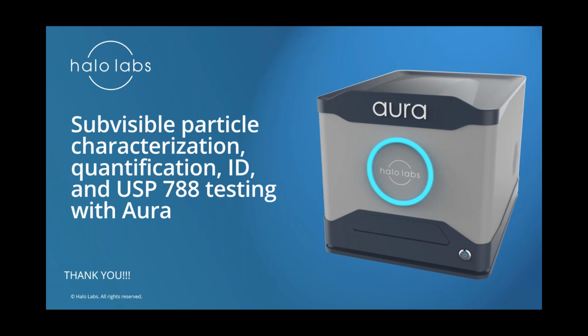I think the jury on silicone oil is out in that it's not immunogenic. While I can understand why some people want to characterize it, plenty of our users have said it's good that we're not measuring things that can confound the measurements, particularly in the small particle size ranges. So in short, we do not measure silicone oil. It goes right through, and we've received quite a good reception as a result, because it tends to confound measurements in the smaller bins.